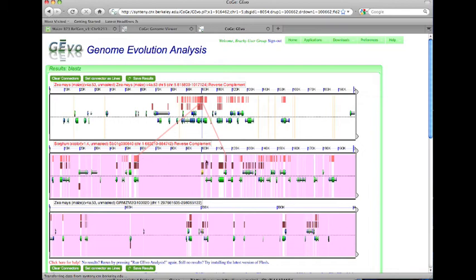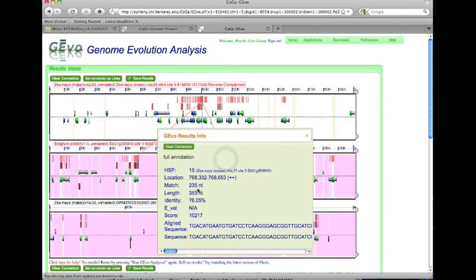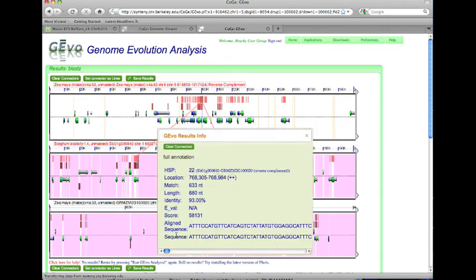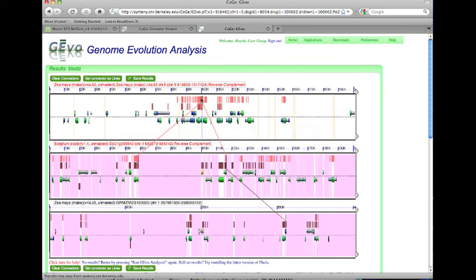So this whole piece of sequence is completely missing from this maize chromosome, and this is actually only 300 some base pairs, whereas the whole gene, when we look comparing the sorghum to the other maize homolog, is 680. So this is a gene fragment that's been conserved in maize, which I think is relatively fascinating, that we can see these leftover chunks of dead genes.